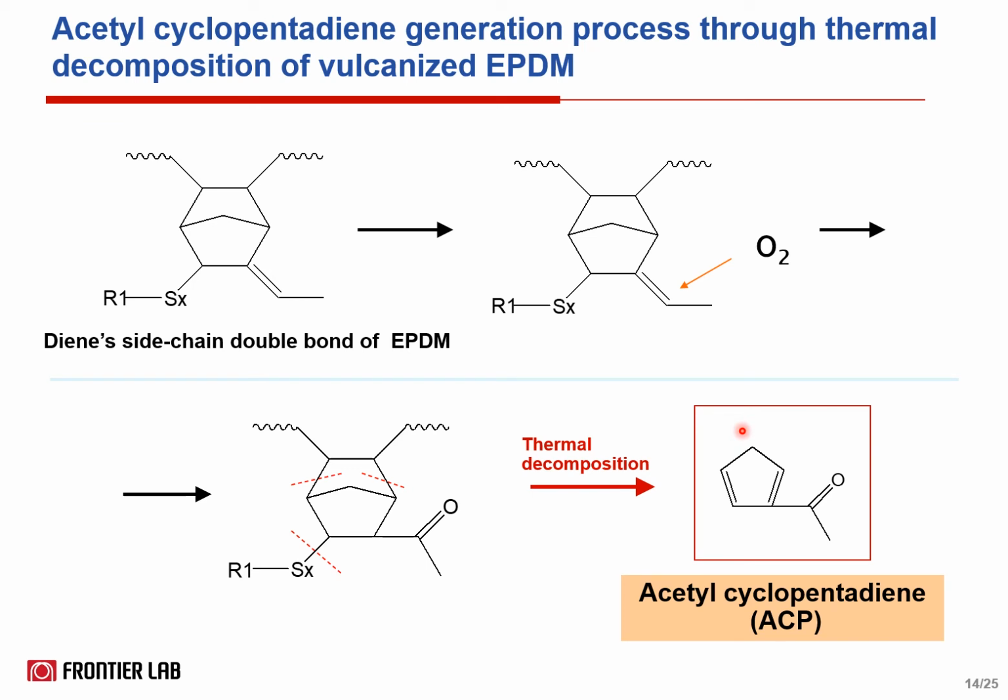It was suggested that the oxidative degradation reaction preferentially occurred in the side chain double bond, which has a relatively high reactivity.